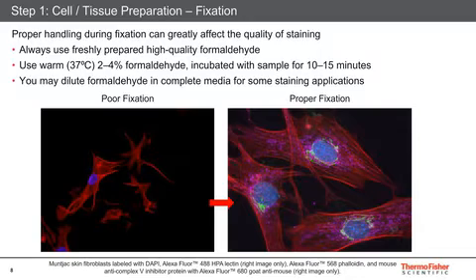These were fixed with formaldehyde, and I have a very basic protocol there at the top, basically fixing somewhere between 2 to 4%, and usually methanol-free is the best choice. Formalin, for instance, is methanol-stabilized formaldehyde, so usually you want to use methanol-free, like EM grade, and fix for about 10 to 15 minutes in PBS or another physiological buffer at either room temperature or 37 degrees. 37 degrees is what I generally recommend, just to make sure in that last moment before fixation the cells are still in their proper physiological state. After fixation, you would then wash.